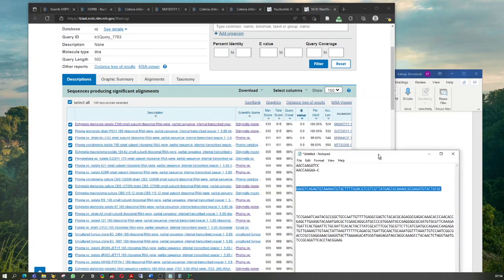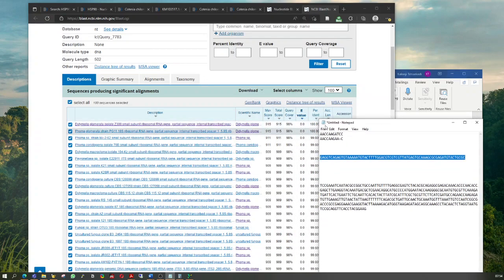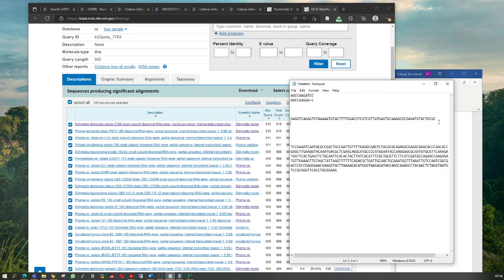The coverage now, let me just move to coverage quickly. With the query coverage, if your sequence is, let's say, this long, let me just remove this part, it's this long, and it found it was matching, but at some point, it couldn't cover the whole sequence, or it only covered a few sequences of what was in the database.